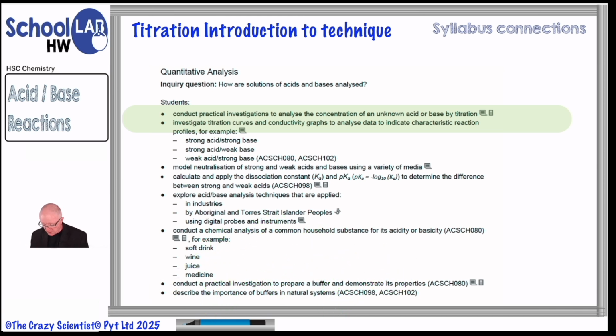So in relation to our dot point here, we're still building up the concepts of what a titration is, so you know what to do, and then we're going to look at it in detail. So let's get into an overview of how you conduct a titration, how we use it to actually determine the concentration of an unknown, and some of the main key features.